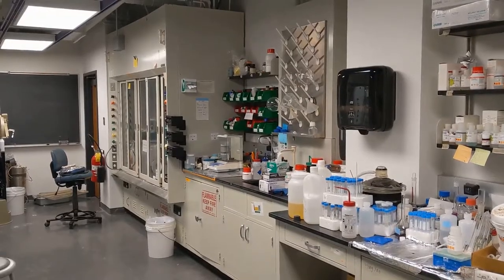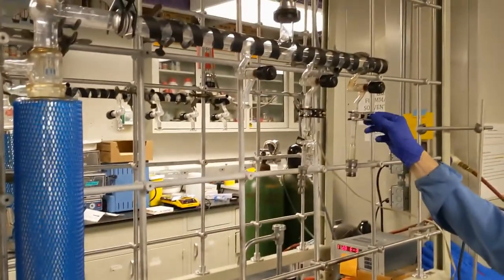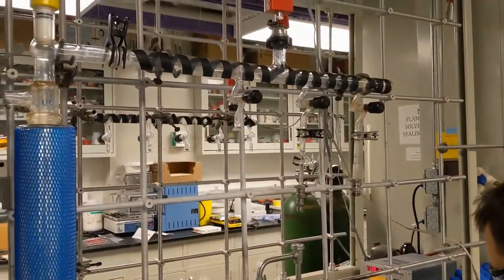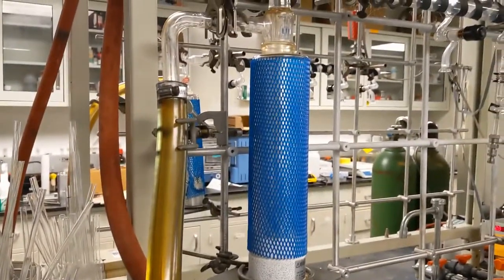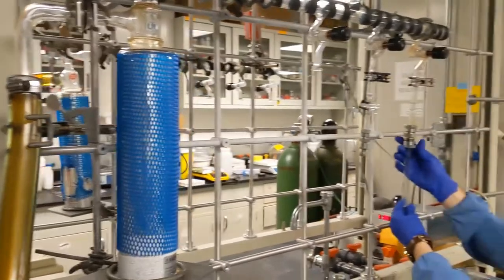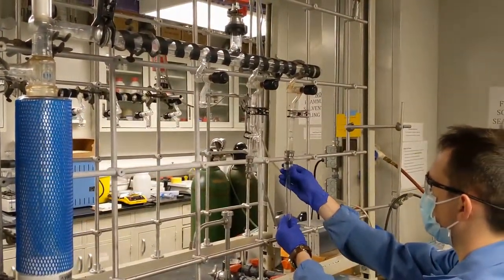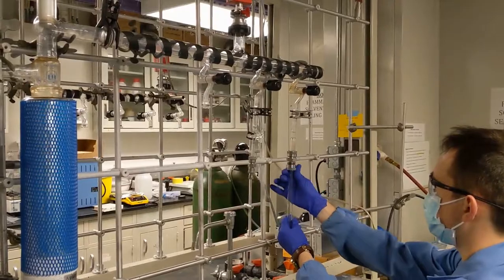So after you've gone ahead and loaded your reactants into your glass tube, it comes time to seal it. We have two different sealing lines here. The idea is that you use the vacuum pumps with cold temperatures to pull the vacuum, set up your tube onto the sealing line, light a flame, and slowly melt the glass under vacuum until your tube has been sealed.